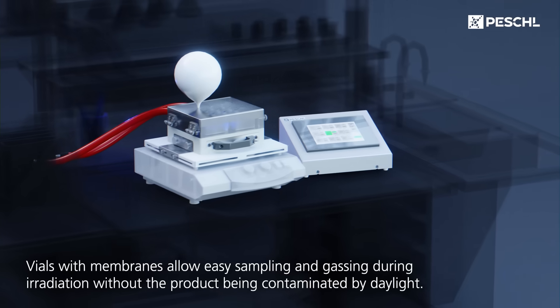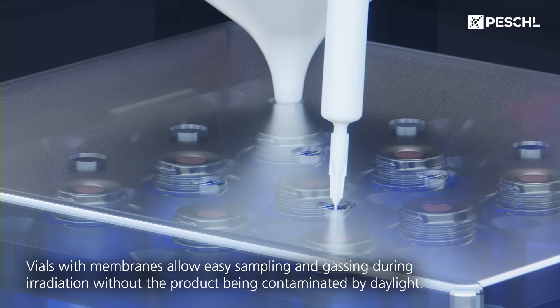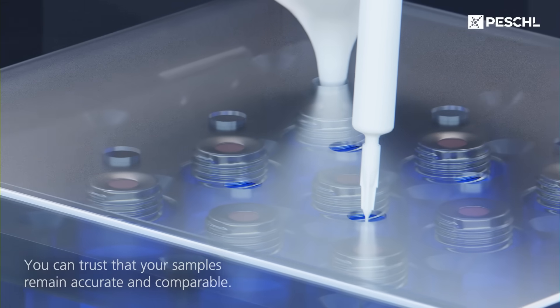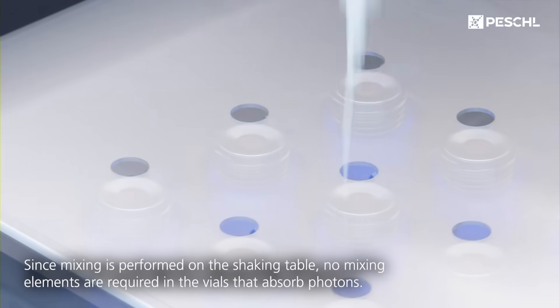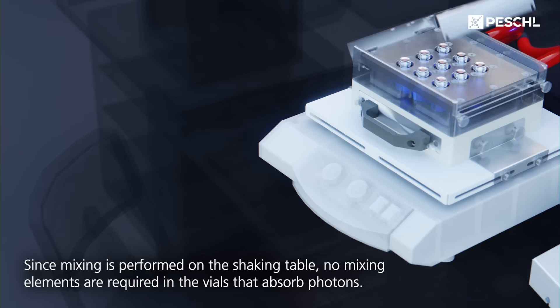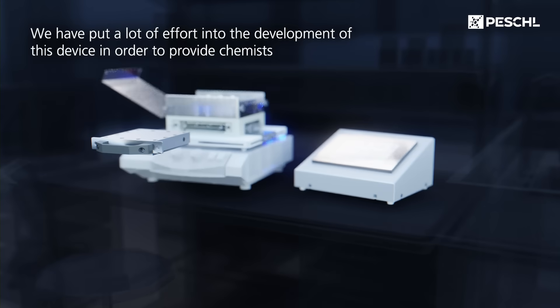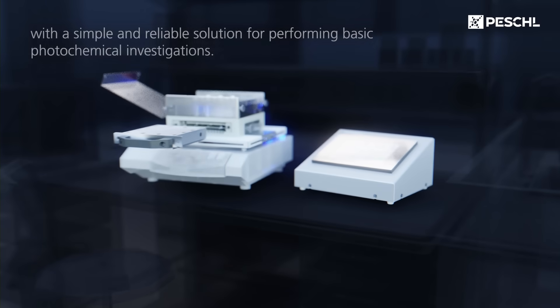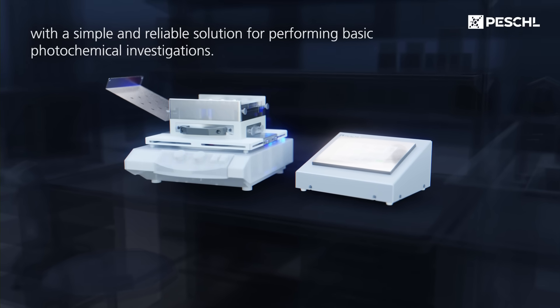Vials with membranes allow easy sampling and gassing during irradiation without the product being contaminated by daylight. You can trust that your samples remain accurate and comparable. Since mixing is performed on the shaking table, no mixing elements are required in the vials that absorb photons. We've put a lot of effort into the development of this device to provide chemists with a simple and reliable solution for performing basic photochemical investigations.